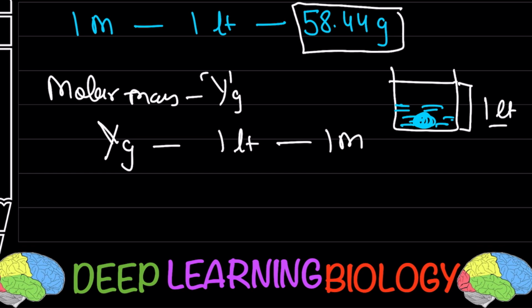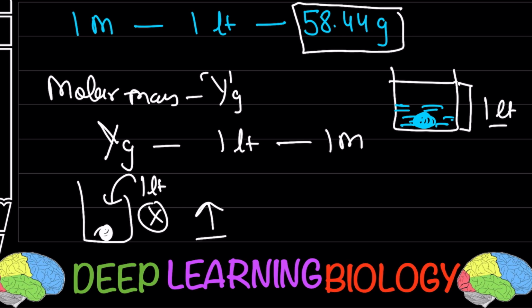Sometimes students make the mistake of taking 58.44 gram and trying to dissolve it in 1 liter. No, this is going to increase the volume, whatever small amount.